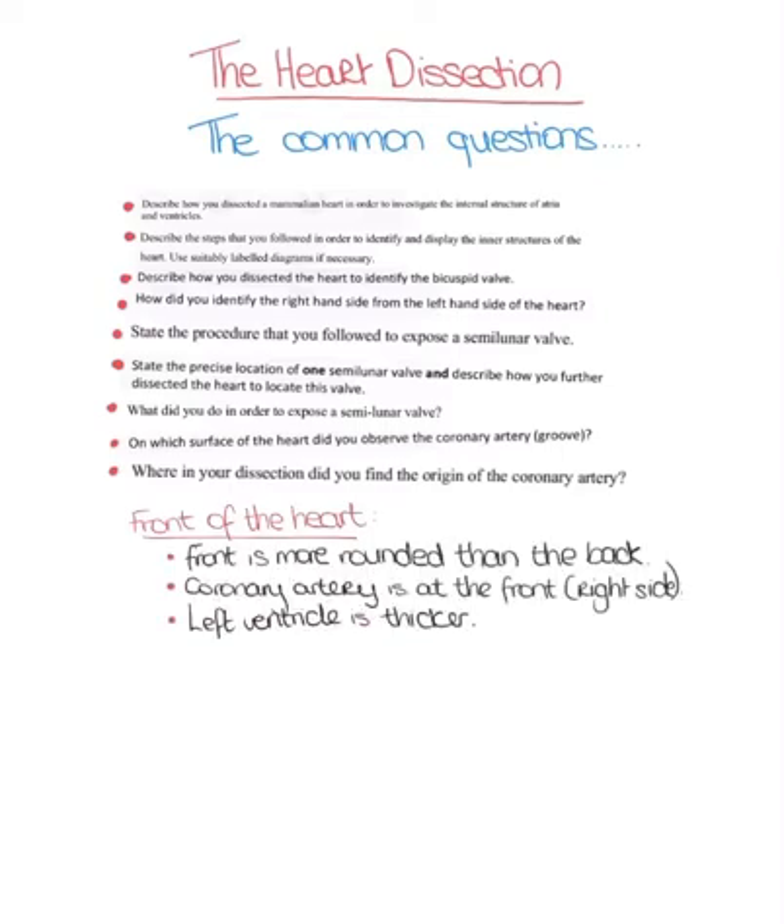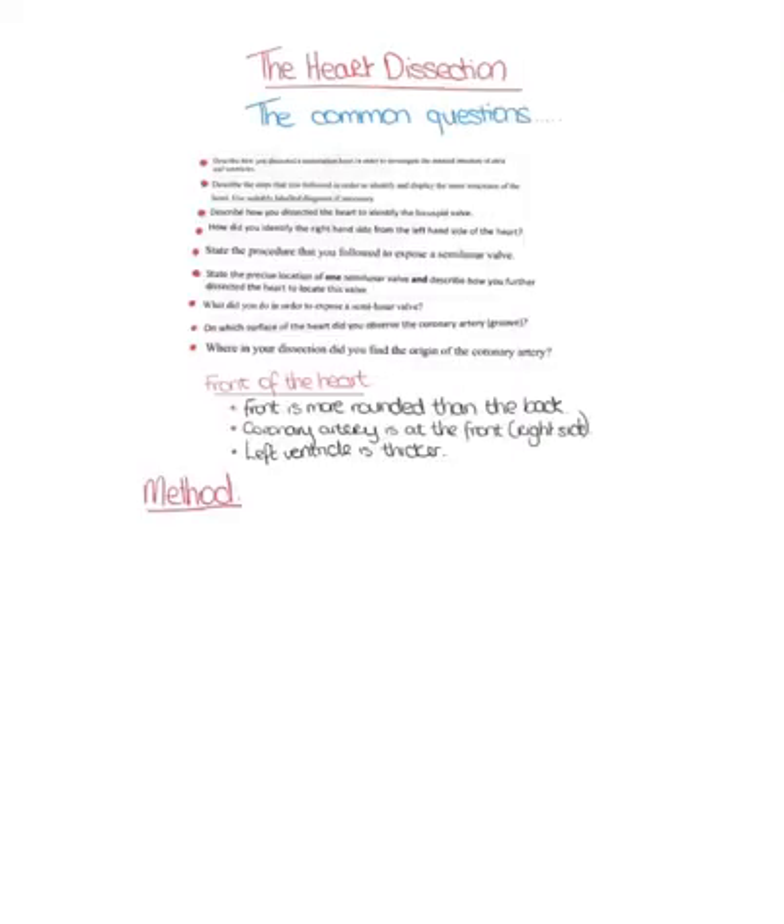The following is the method that you would follow in your heart dissection. The first thing you would do is cut into the left ventricle using a scalpel. You know it's the left ventricle because it has a thicker wall.